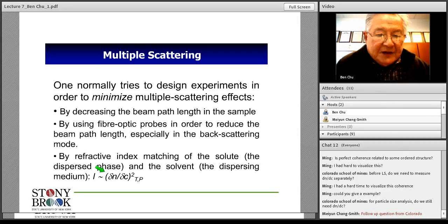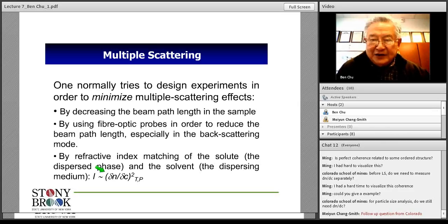In other words, you want to determine the molecular weight distribution function from dynamic light scattering. Then, in order to change the size to molecular weight, you need the dn/dc. In other words, you do not know the absolute value, so you do not know how the thing will spread.